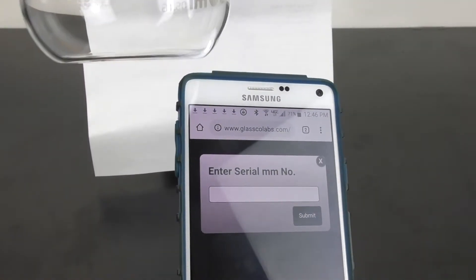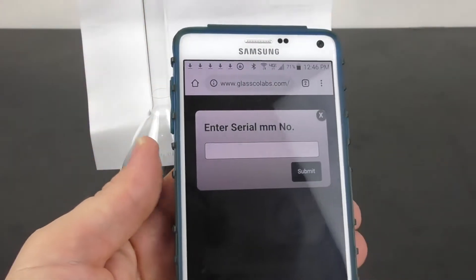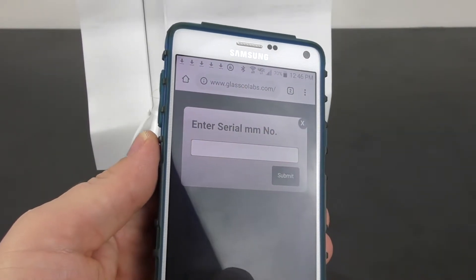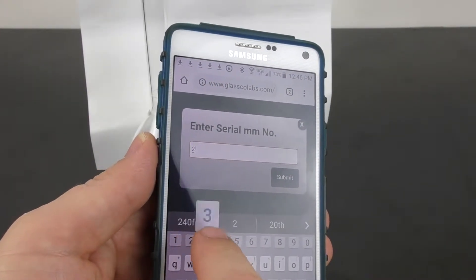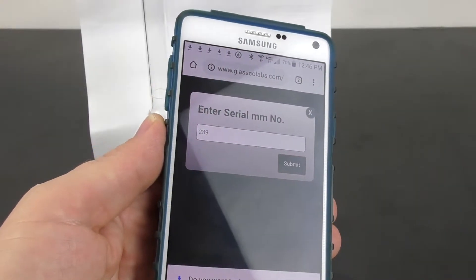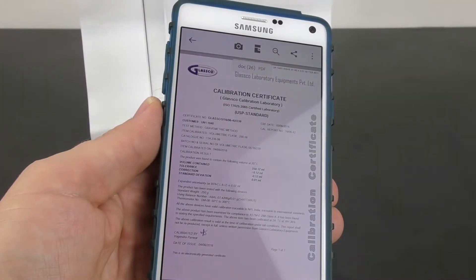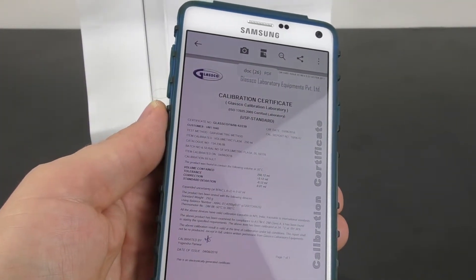It's asking for the serial number. In this case it is 239, so you enter 239. Everything else is the same, and there is your individual certification report.